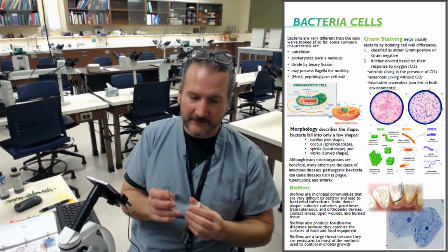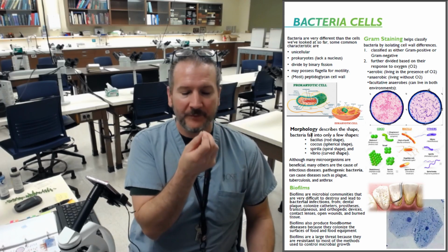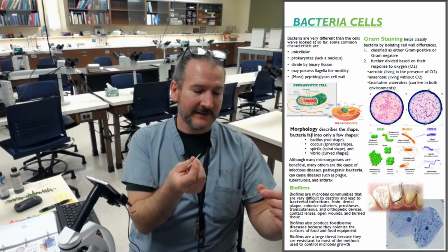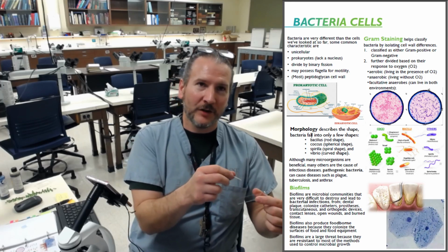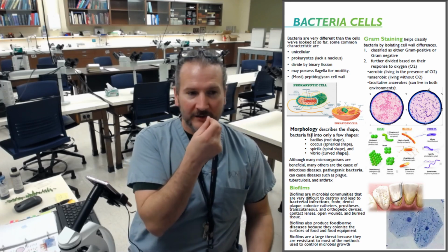take your glass slide, you're going to try and scrape. And be very careful because it's sharp, but just above the gum line, not actually touching your gums, the pink part in your mouth, but on your teeth, and you're going to see if you can scrape anything off right along that gum line, or the front of the tooth, or inside the tooth, but make sure you're only scratching the teeth. You can also test this with your toothbrush, so you can take your toothbrush and put in a little bit of water and just rub the water off the toothbrush across the surface of the slide and use it that way too, but let's see if we can get something off.